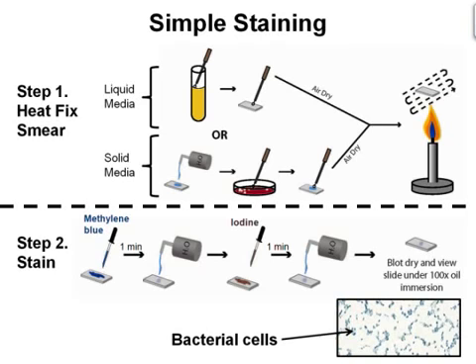Allow the dye to remain on the smear for approximately 1 minute. Note, staining time is not critical. Somewhere between 30 seconds and 2 minutes should give you an acceptable stain. The longer you leave the dye on in general, the darker the stain.